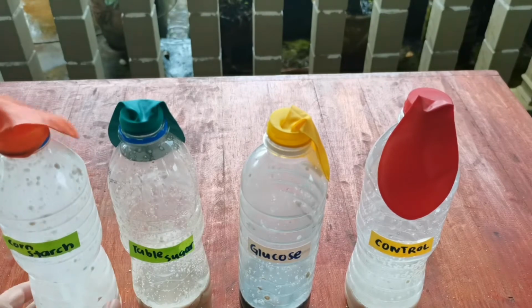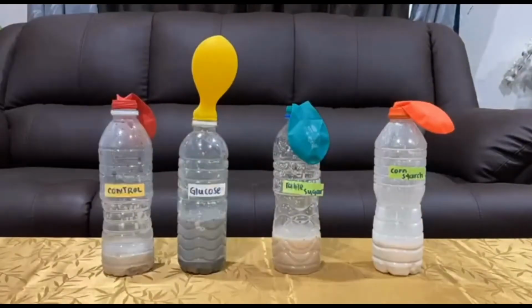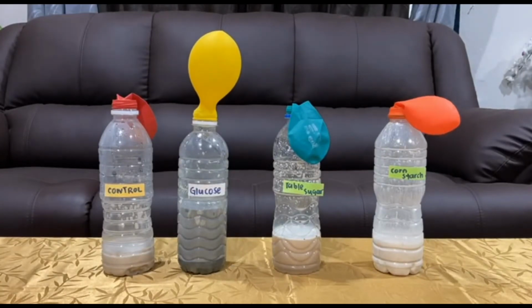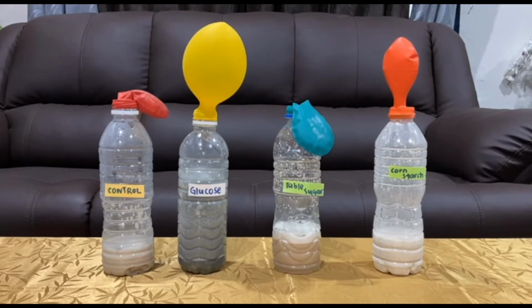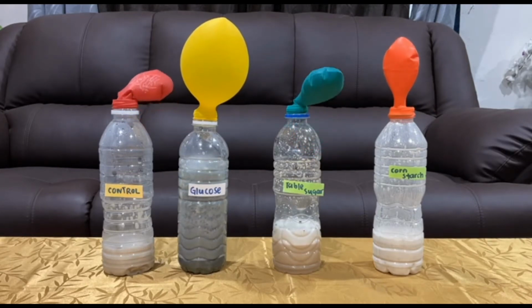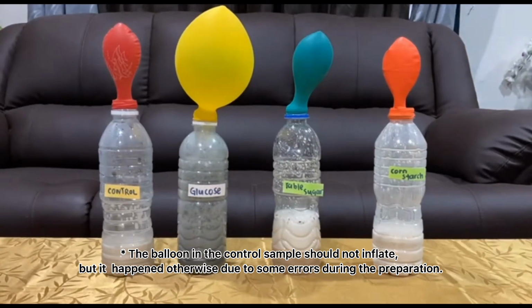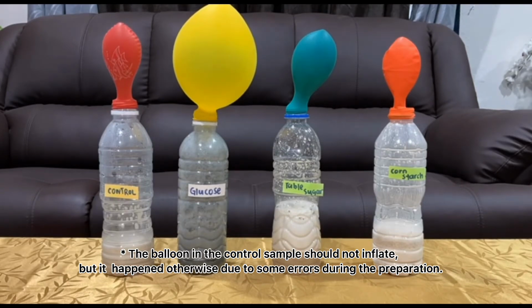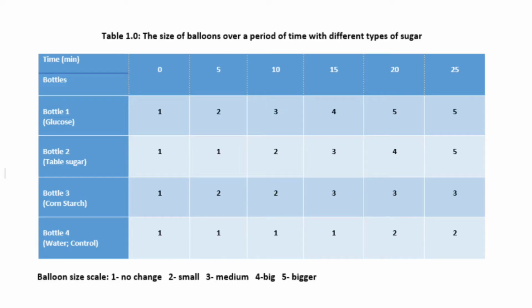And then, let's start our observation. So here are the results and the size of the balloons observed.